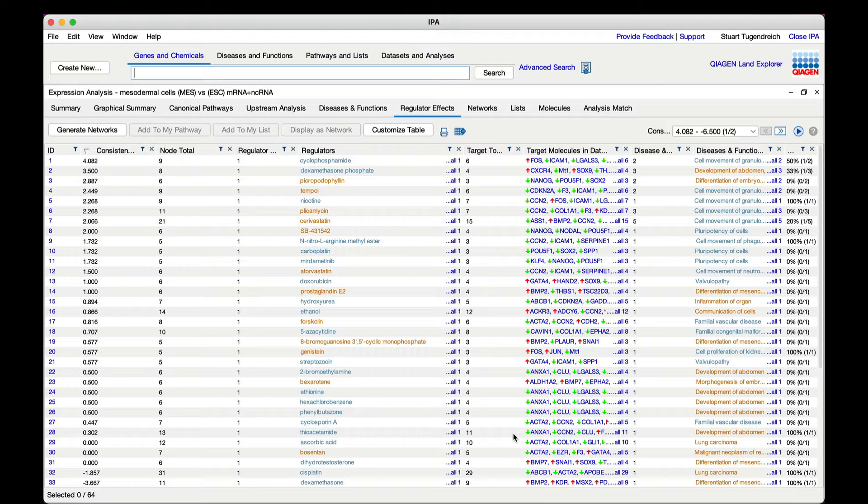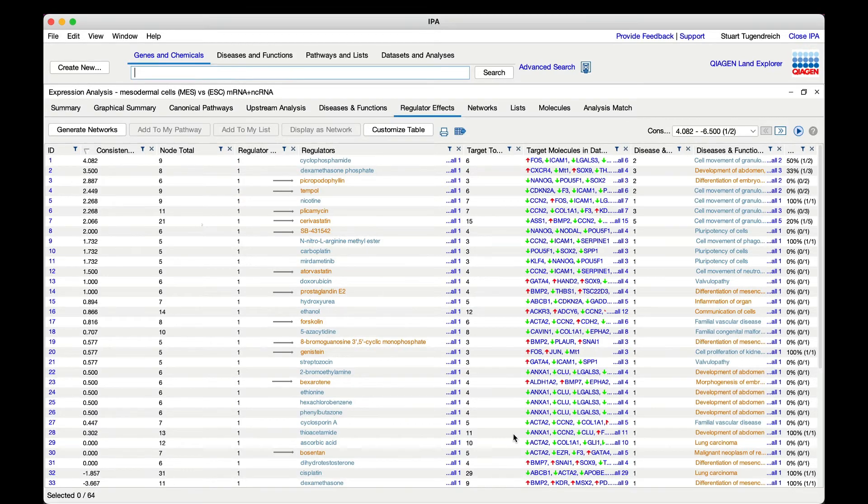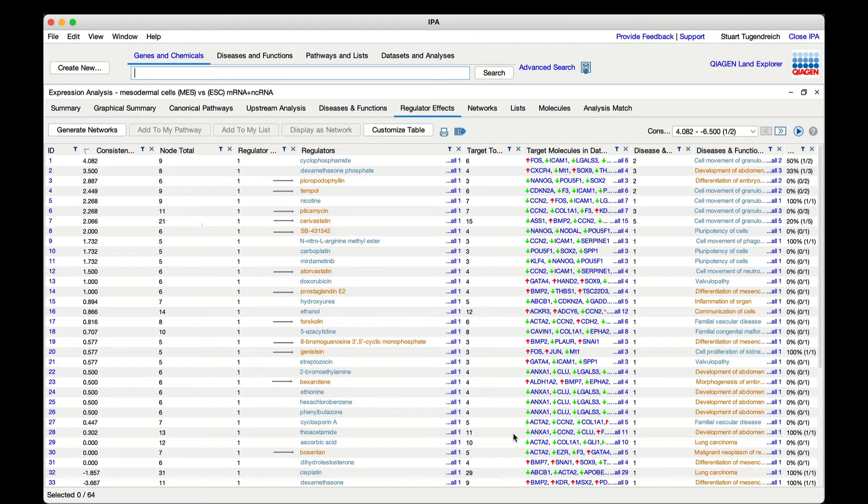Compounds with orange font in the table are considered increasing which means that the direction of the differentially expressed genes in the data set are consistent with the known effects of that compound on the genes in your data set. One way to interpret this is that it is like the numerator or case samples in the data set had already been exposed to this compound.